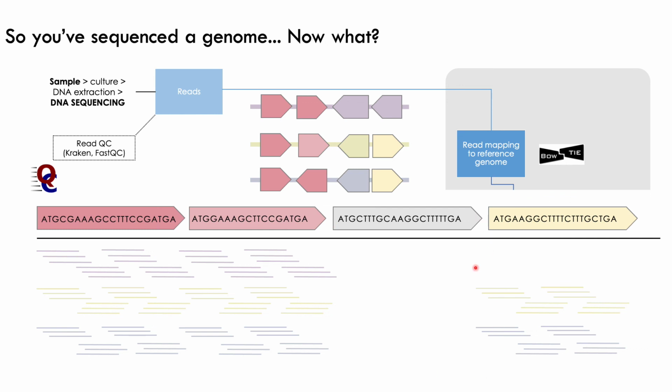What we would get though, using this method, that we wouldn't get in a core gene alignment, is intergenic regions. So you can see here for our green and blue genomes, we do have reads covering the intergenic region between the grey and yellow genes. So this could be really useful and important for understanding reasons why genes are lost or missing from certain genomes.